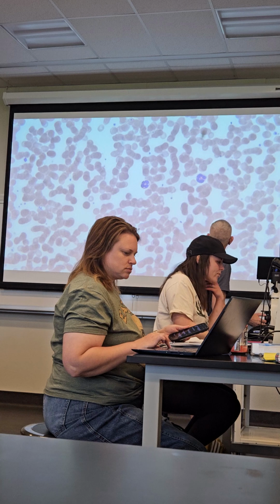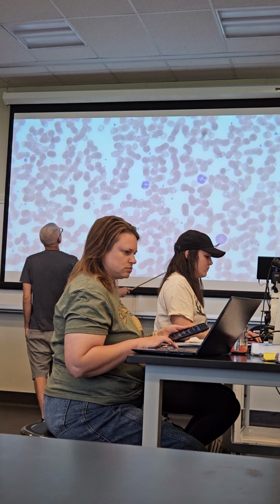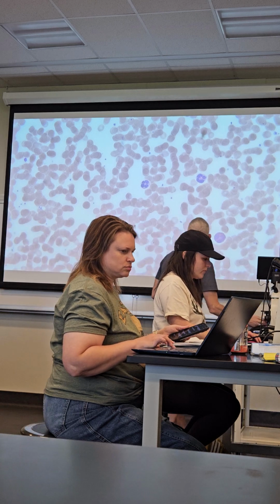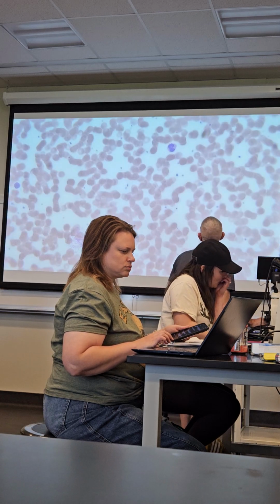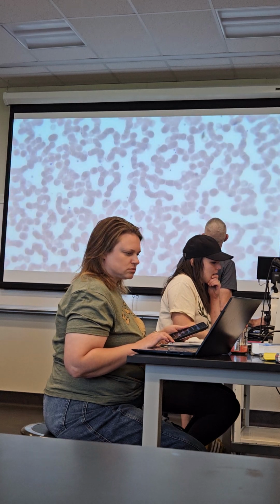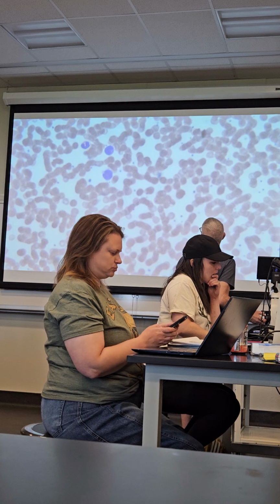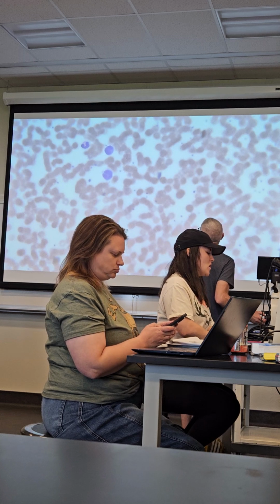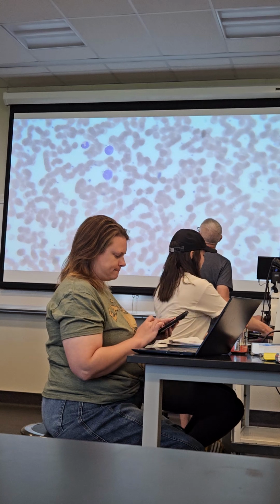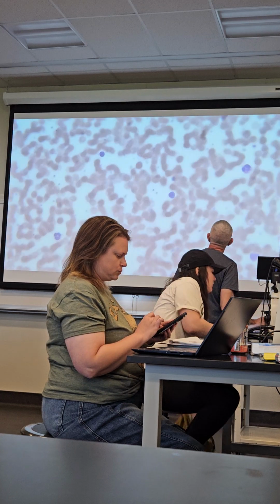What do you guys think that is? Eosinophil. It's one EO and 2 neutrophils. Another neutrophil. That one looks interesting. Now, that's going to be 2 monos next to a neutrophil. But you guys get the idea.